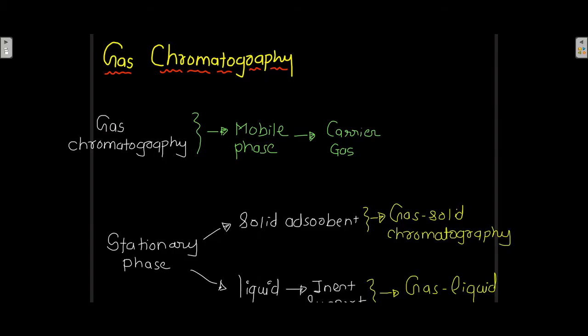Welcome. In this video, we are going to discuss gas chromatography. Now, in gas chromatography, the mobile phase is a carrier gas. Okay, you use carrier gas as a mobile phase during gas chromatography.